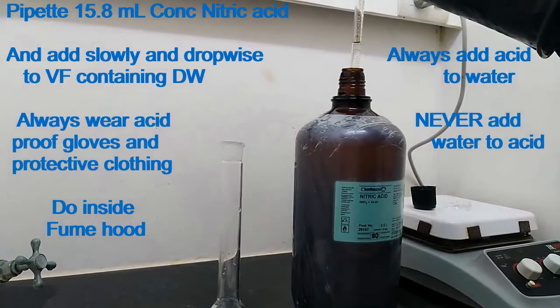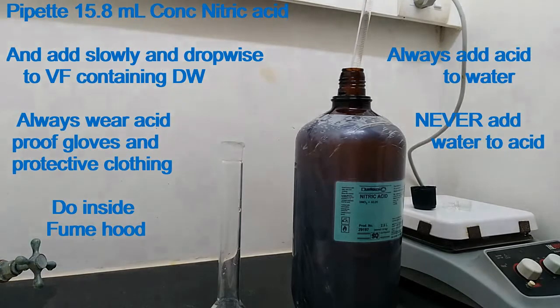Always wear acid-proof gloves and protective clothing. Do this inside a fume hood. Always add acid to water. Never add water to acid.